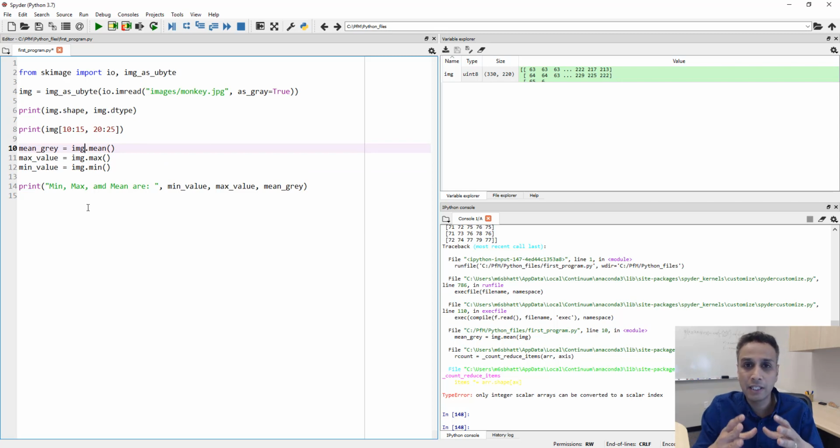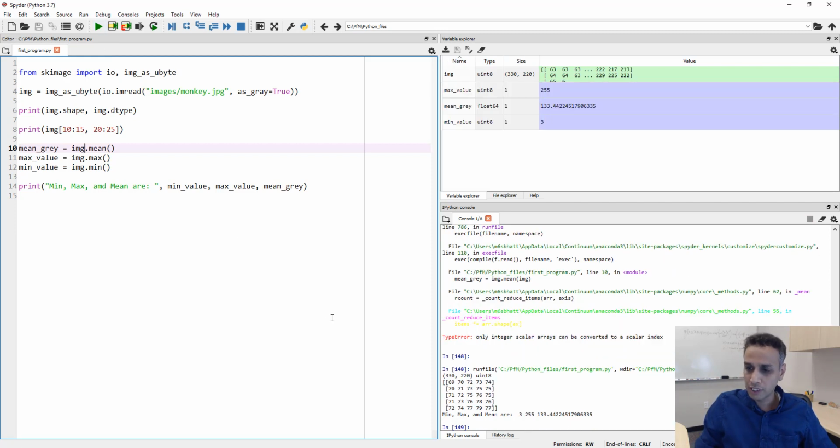Again, these are the mistakes that, if you watched all of my tutorials, you can see that I make almost on a daily basis. I never seem to learn, but then I don't do this every day on a regular basis. But if you do this, it would be like second nature. So let's go ahead and print this out, and hopefully we should see some values now. Min, max, and mean are 3, 255, and 133.444 something. Okay, so these are the minimum and maximum.